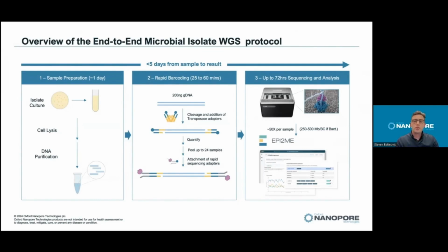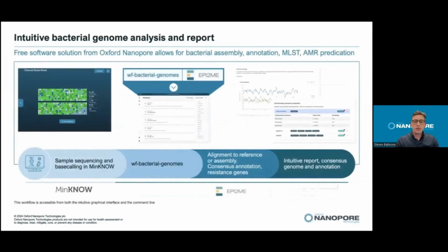And like all nanopore sequencing experiments, the sequencing run can be stopped once you've generated enough data. And then we move on to analysis. Our EPI2ME workflow for bacterial whole genome analysis is known as wf-bacterial-genomes. EPI2ME can be run on any platform, Windows, Mac, or Linux, and via graphical or command line interfaces.